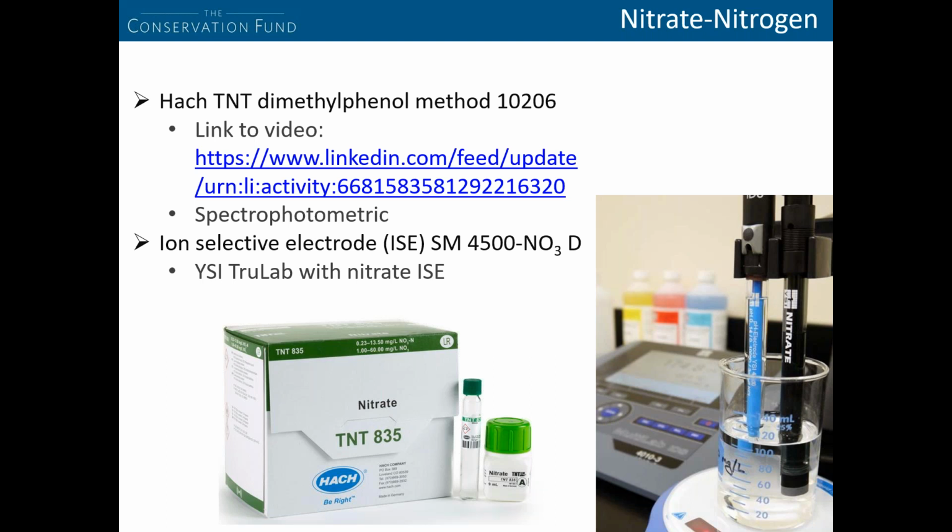The nitrate ISE, the way that it works is it is a selective sensor that develops a potential across a thin inert membrane that holds in place a water immiscible liquid ion exchanger. And then that electrode responds directly to nitrate activity.